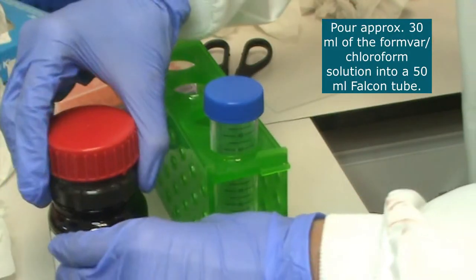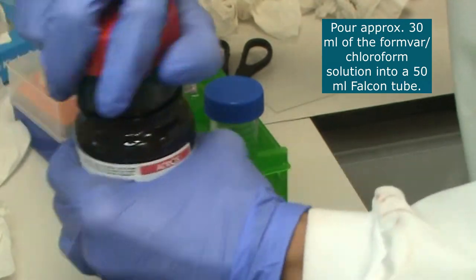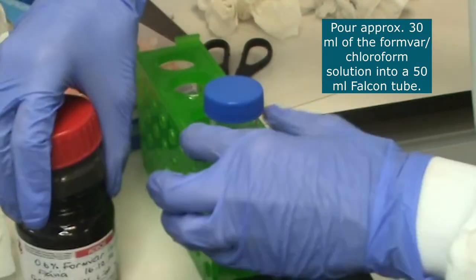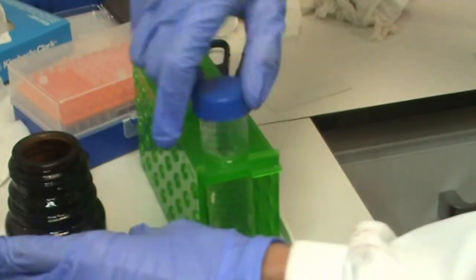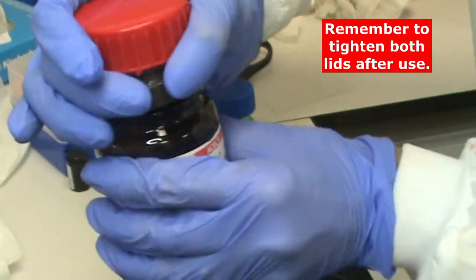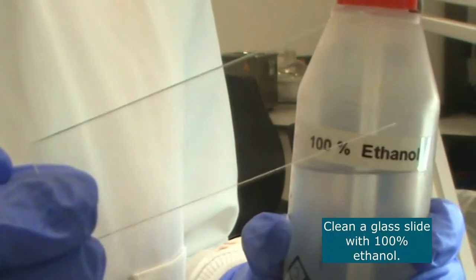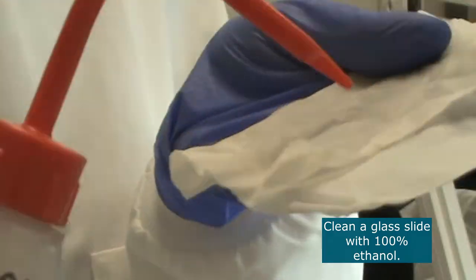Pour about 30 milliliters of the formvar solution into a Falcon tube. And don't forget to close both lids of the formvar stock. Clean a glass slide with 100% ethanol.